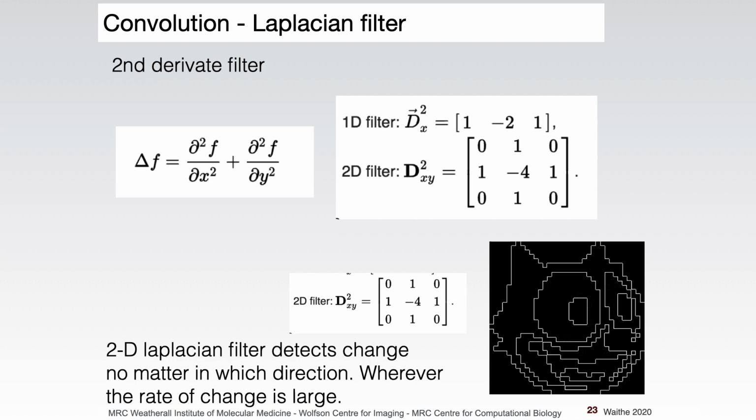So what we were doing before, these were first derivative filters. So we were finding where the gradient of the image becomes stationary. And with a second derivative image, we're finding where the velocity of that image is stationary. So this is actually the edge itself, dead on the edge.